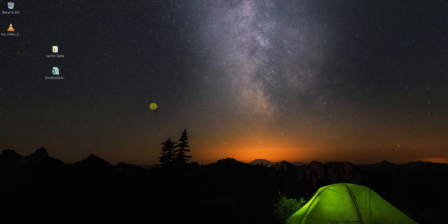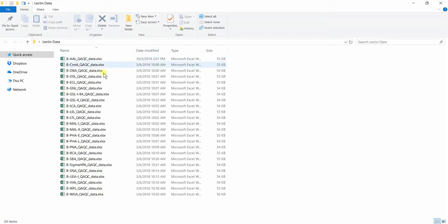Welcome. In this video, I will show you how to use the ExceltoGLAD macro which we have to convert a large number of Excel files into the GLAD format.